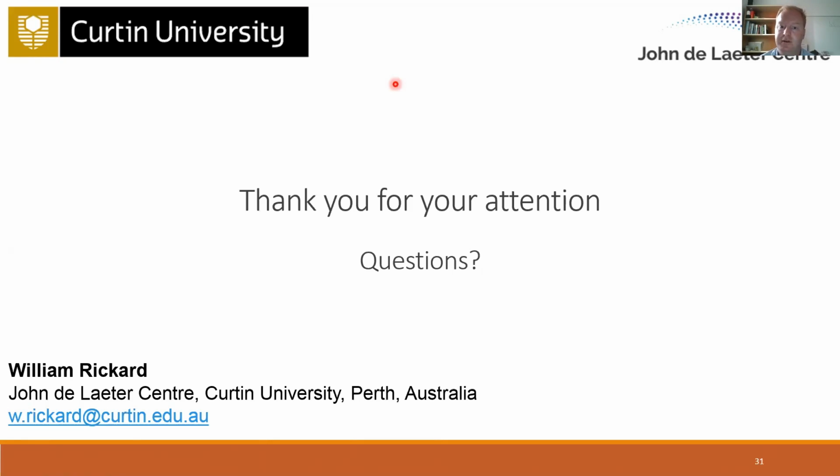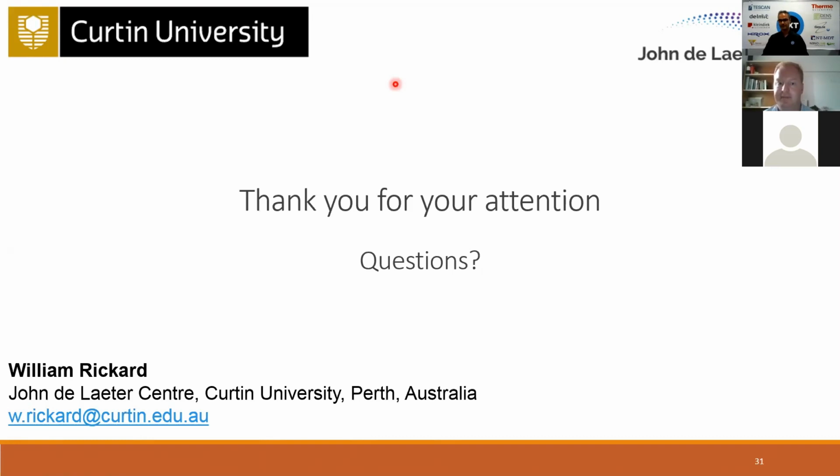There's a low sensitivity, generally speaking, for negative ions, and so they use a cesium vapor that they spread across the surface, and that improves the secondary ion yield for some negative ions. If you go to Google Scholar, you should be able to find some publications related to that.